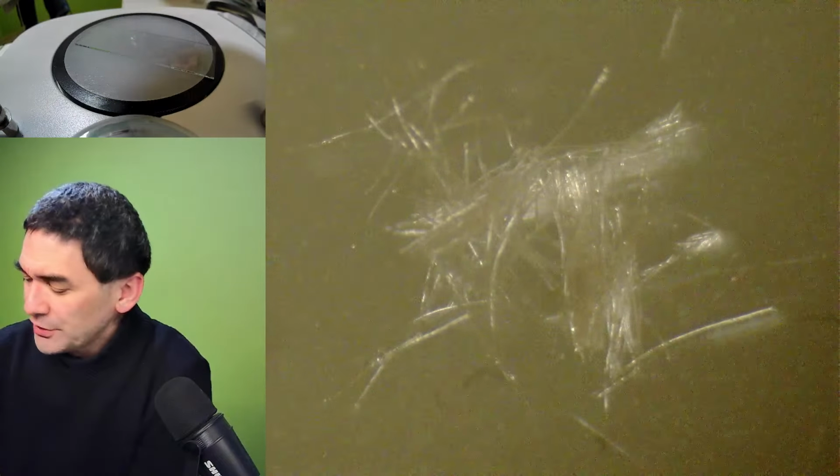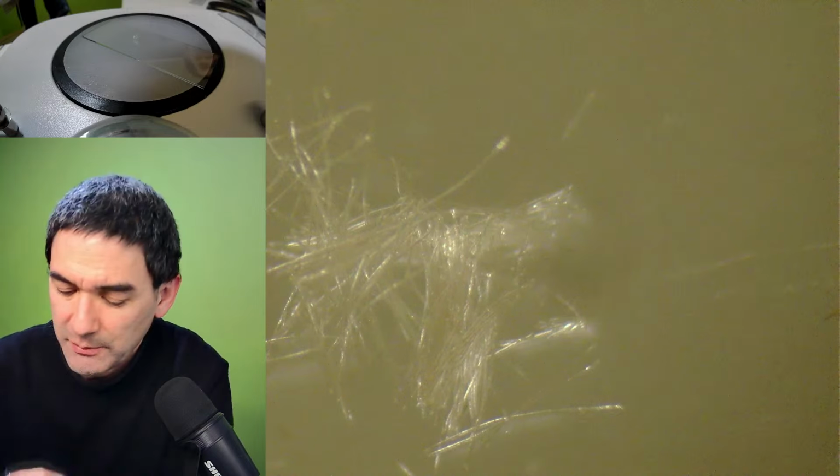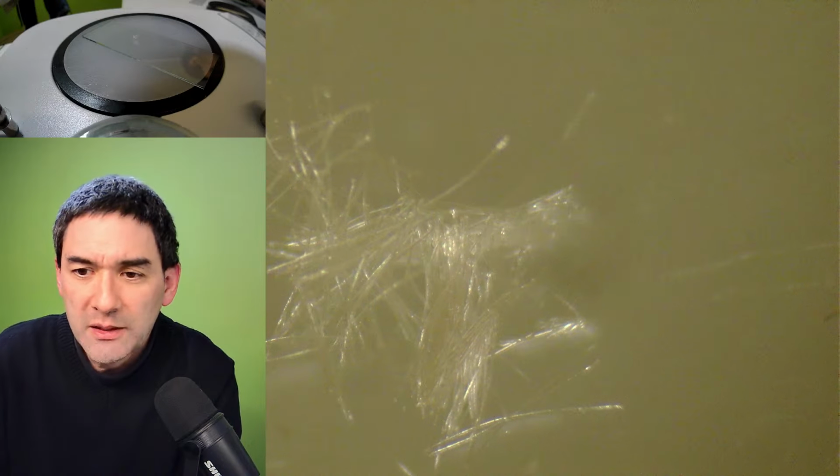Something that I also have not yet optimized is getting algae to glow, because what they do is the chlorophyll also starts to fluoresce, however, you need to do a long time exposure for that.